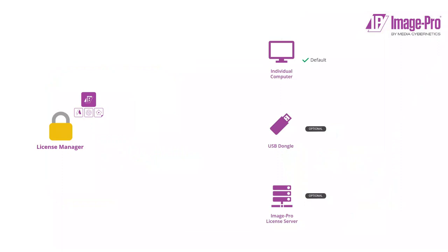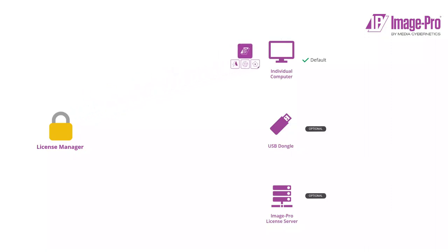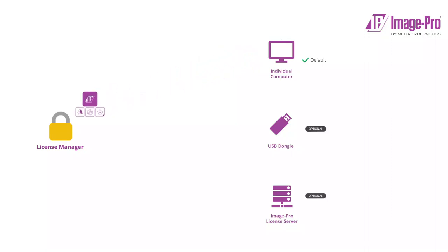License bundles can be linked to computers, dongles, or the license server using the License Manager. When a bundle is linked to a computer, all users of that computer are licensed to work with ImagePro. License bundles can be unlinked at any time using the License Manager and relinked to another valid target.